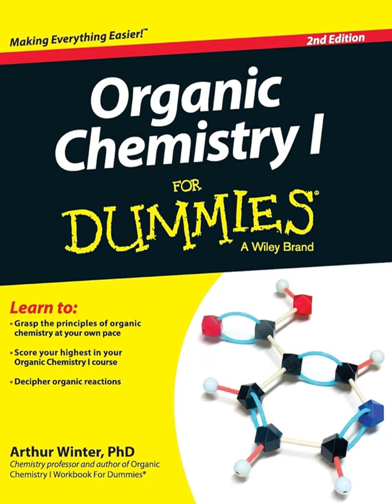But don't dismiss it entirely. Definitely not. The fingerprint region is incredibly useful later on for confirming the identity of an unknown compound. If your unknown sample's fingerprint region perfectly matches the spectrum of a known reference compound, they're almost certainly the same molecule. Exactly, it's powerful confirmation. So it's great for proving identity, but maybe not the best place to start for figuring out the structure from scratch.